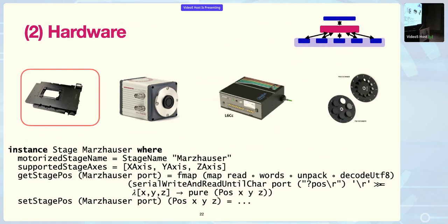So we also have a prior stage, which is just a different brand, and even a remote stage, which can adjust its position by itself, by seeing what it monitors. Also, it's modular in terms of the microscopes that it's deployed on. We have 3 microscopes in the lab of a different brand on which it is deployed. So it is modular in terms of hardware.